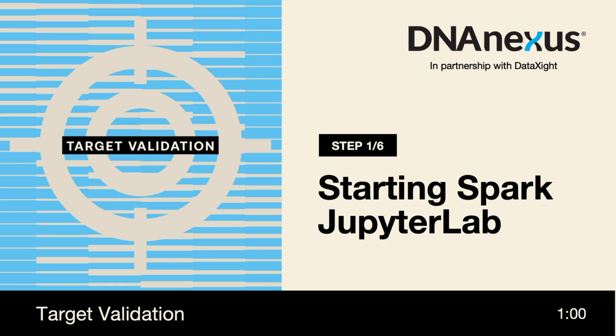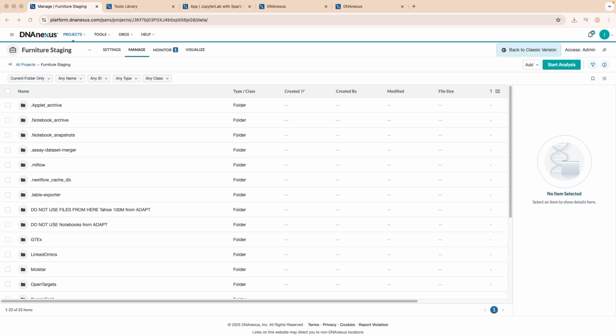Welcome to the 6-part series on analyzing open targets data. In this first video, I'll show you how to start a JupyterLab session with Spark on the DNAnexus platform.